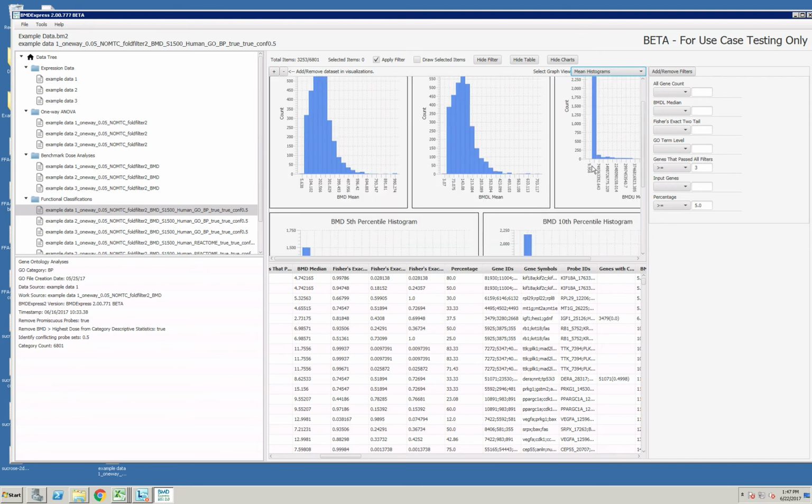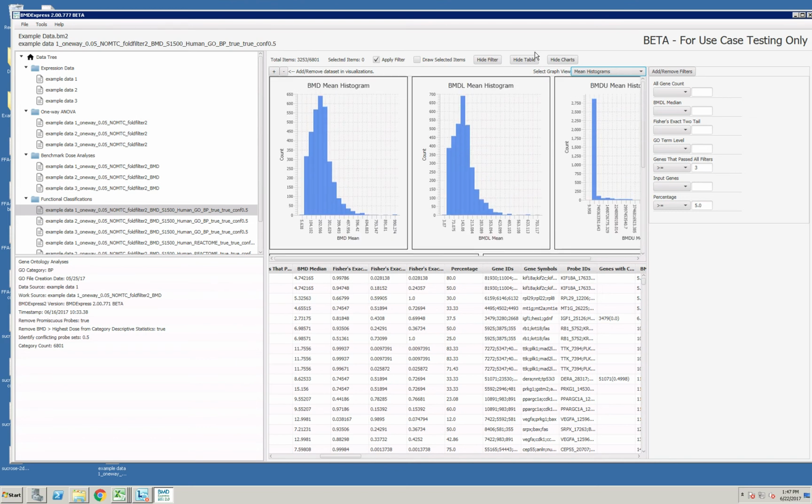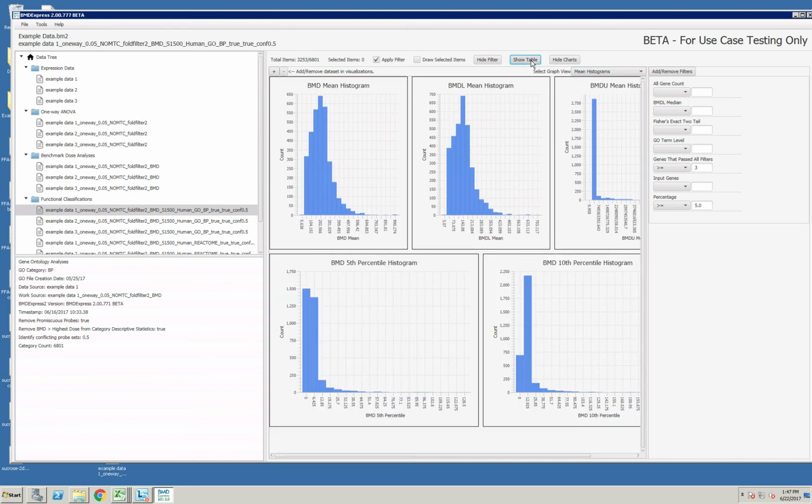So you should be careful. Sometimes there are more plots below the plots that you can see, so you can hide the table and actually take a look at those.